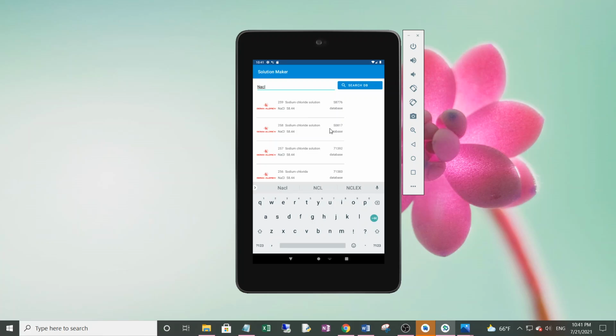I pre-inserted the database with some very commonly used chemicals from Sigma, so you don't have to input them yourself. There are different catalog numbers because they have different purity, so choose one which fits your need, or that your lab already has. Either one should work fine.